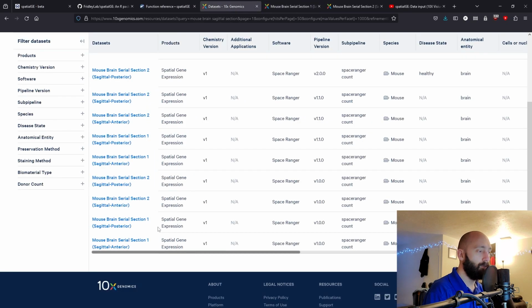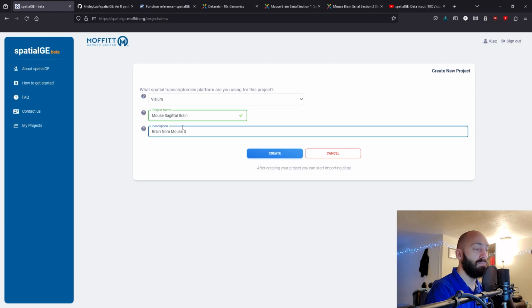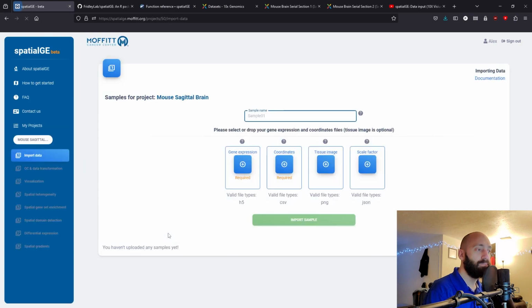I gotta go back here. Aha, nailed it. Brain. Description, we'll just call it brain from mouse sections. Visium. And then we can go ahead and create.